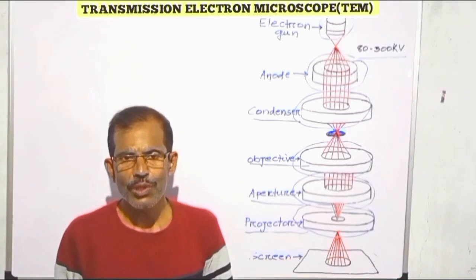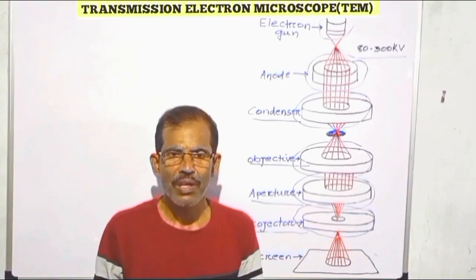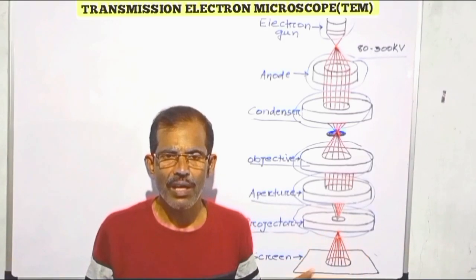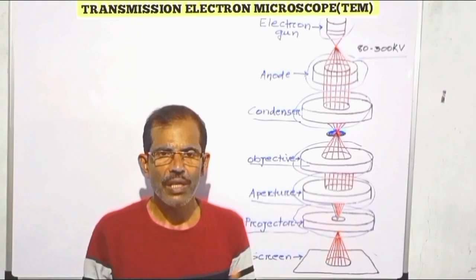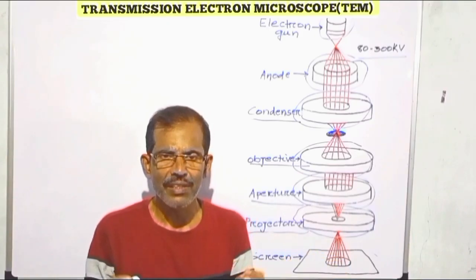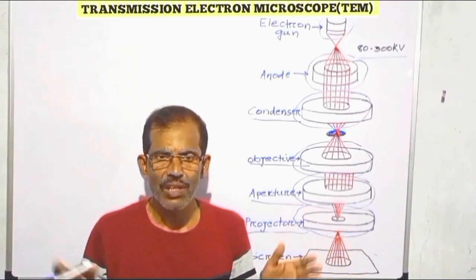In addition, in cell biology, TEM is used to visualize the ultrastructure of cells, the cell membrane, and various intracellular organelles. Finally, this technique is also used to study the mechanisms of various diseases such as specific kidney disorders, lysosomal storage diseases, and muscle and nerve disorders.